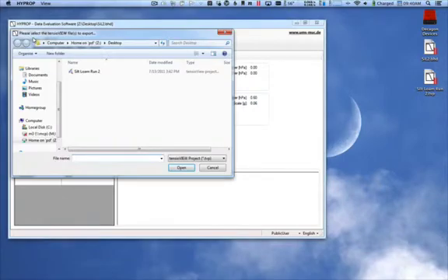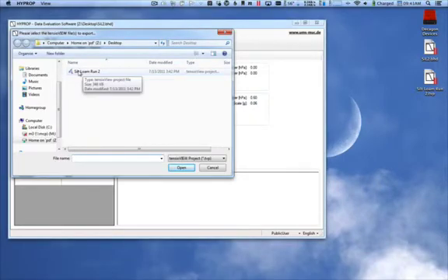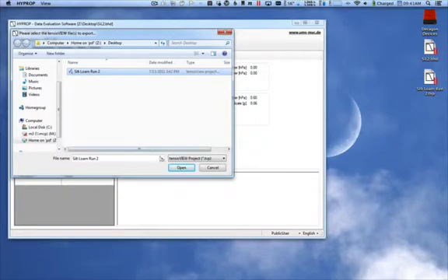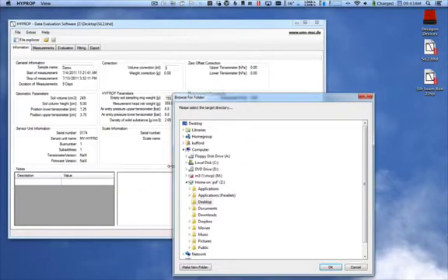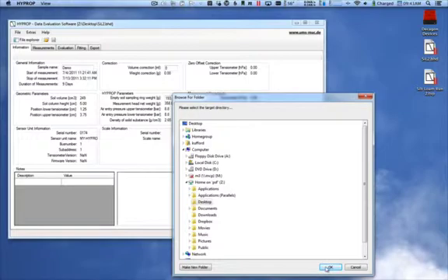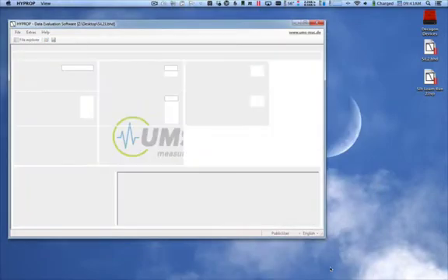Here we can select our Tensio View Project file from our HyProp measurement to export to the HyProp Fit software. We can also select a folder to have the HyProp Fit file output to. Click OK once you've selected the correct folder.